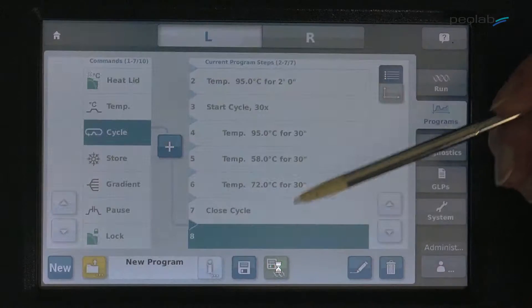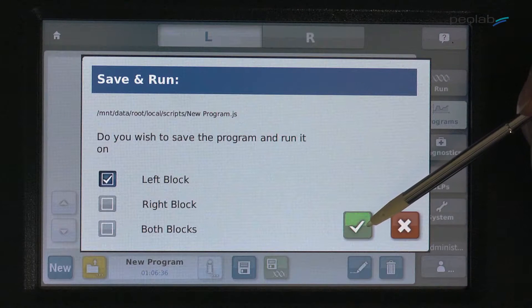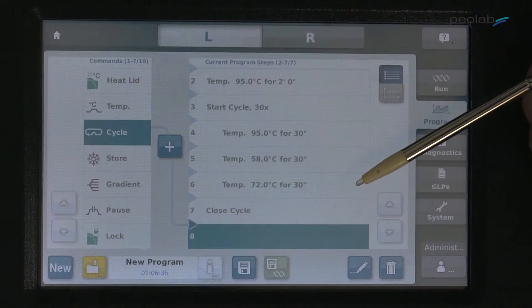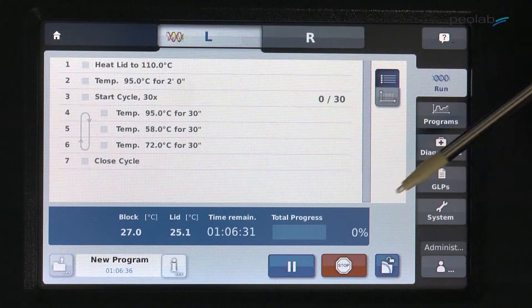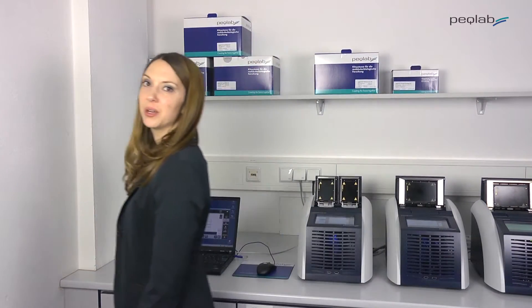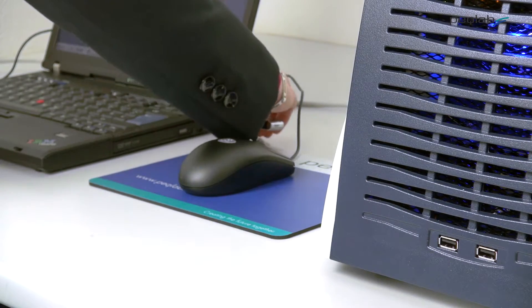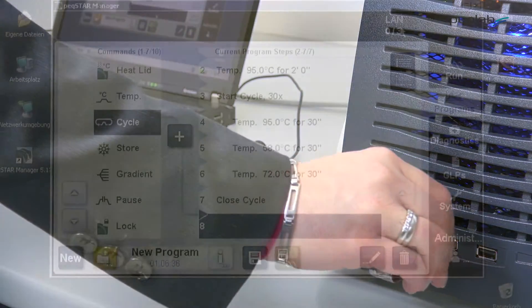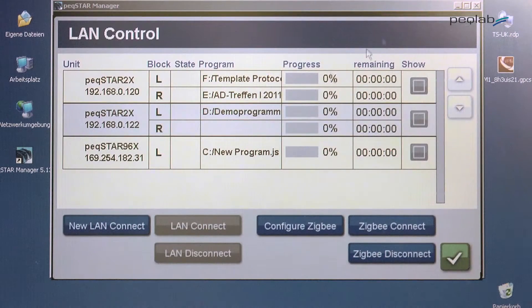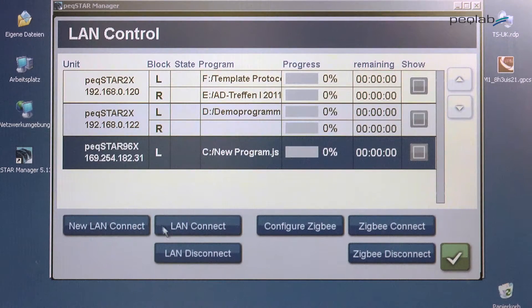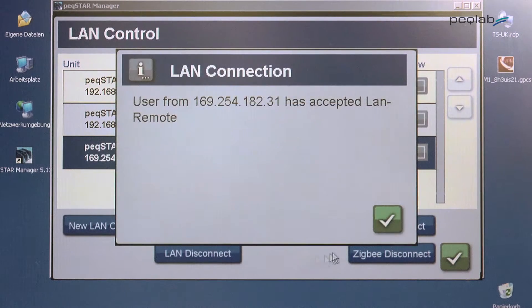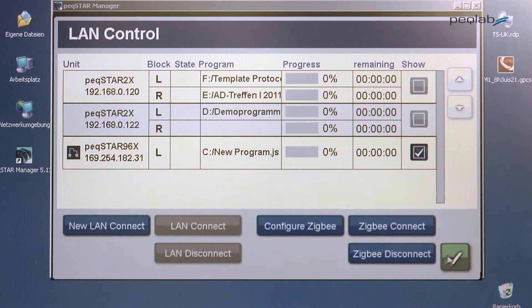Hit save and run and the program will start on the selected block. Creating and running PCR programs couldn't be simpler. You can also develop PCR programs on your PC and transfer them by USB stick to the cycler, or even remotely control the whole PCR run from your desktop computer via network.